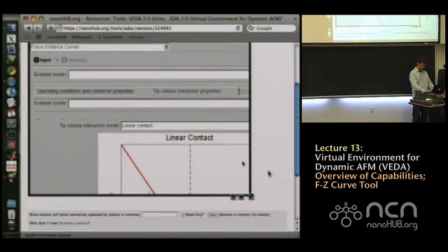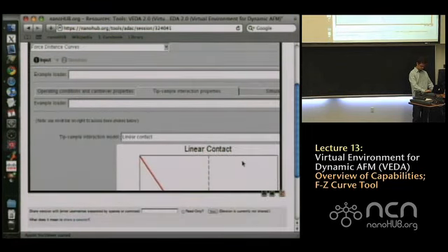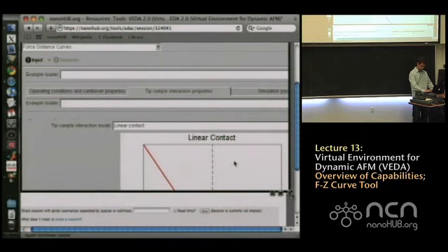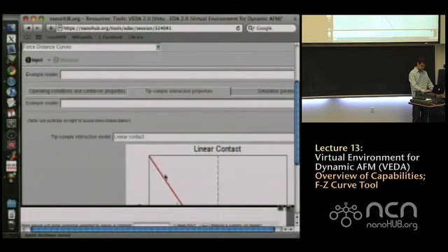But there are a lot of samples where your tip indents on something like a thin plate, or like a shell. So it's got a very thin thickness, and it's not like a solid bulk thing sitting on a sample. It's actually a suspended structure somehow.